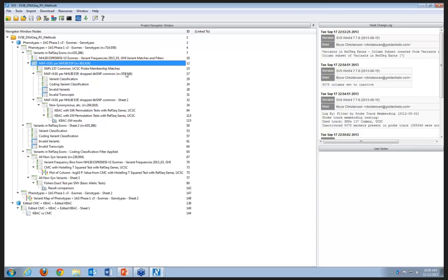That reduces the list a little bit more. Again, it produces another report. Then we run it through a variant classifier where we reduce just the variants that are non-synonymous or, I guess you'd say, non-silent. We're just taking out anything that was classified as synonymous. And we end up with about 204,000 variants across the exome that are considered to be rare and non-silent.